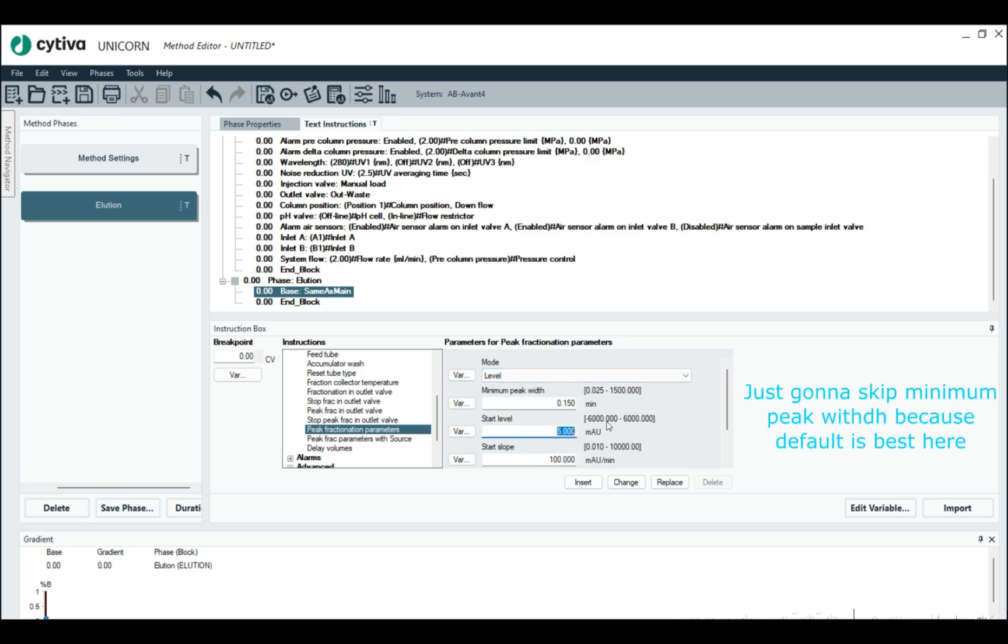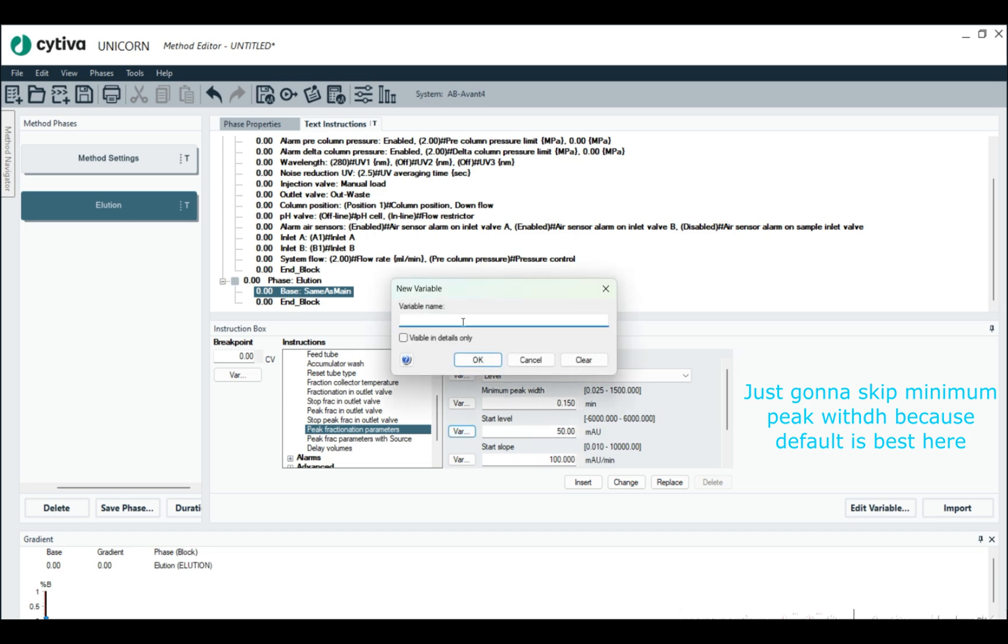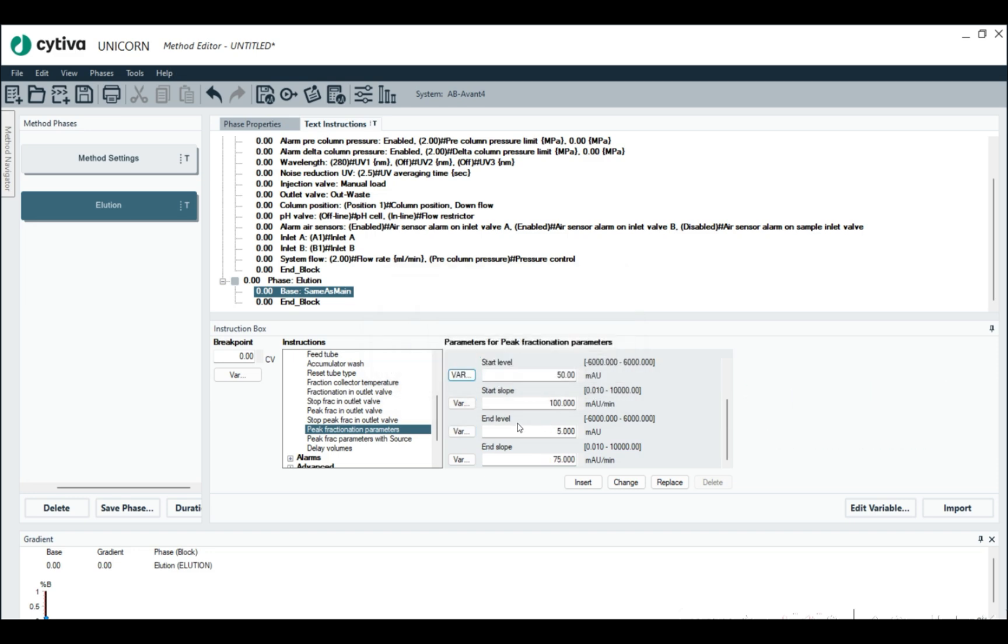We can make this a variable if we want to. And then we're going to do the end level. Yeah, we're going to do the end level. I'm not going to make that a parameter this time.